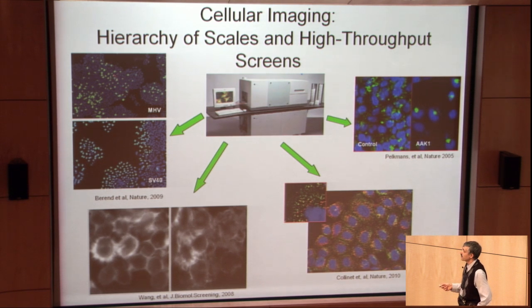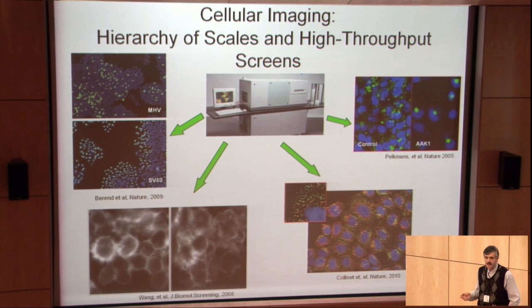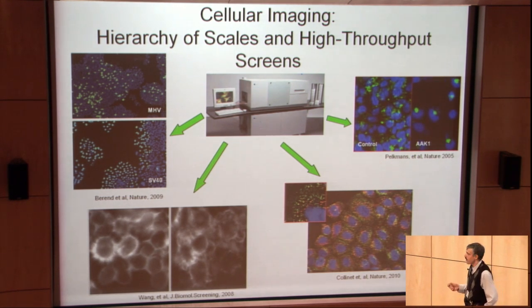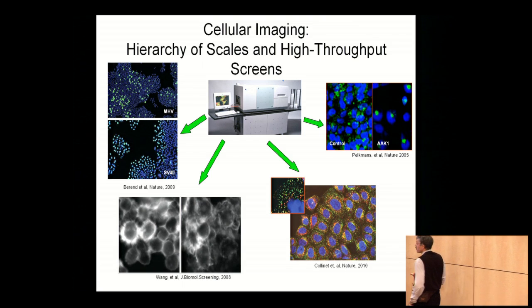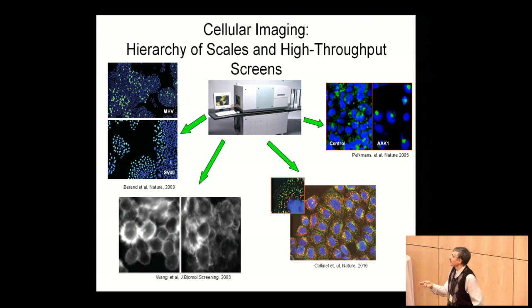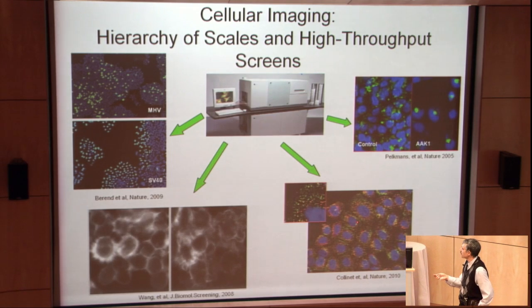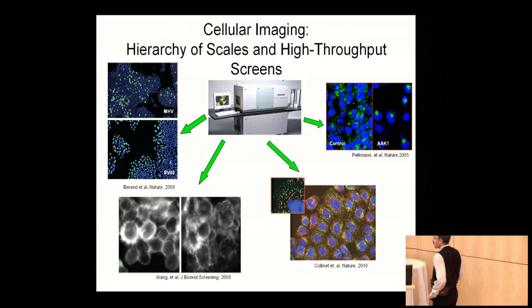So for example, the algorithm which we'll use to recognize these nuclei will not work on this image. Then if you go inside the cell, for example here, these individual dots are organelles, in this case endosomes, and they are much smaller than nuclei. And again, the algorithm which we can use in the first case you can't use here, because in this particular image you will be limited by diffraction, and your image will be much more pixelated, so the previous algorithm will not work.